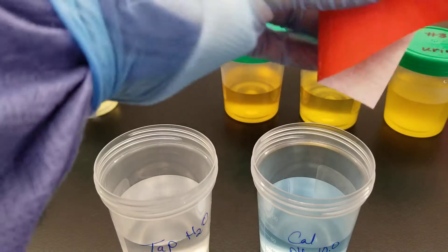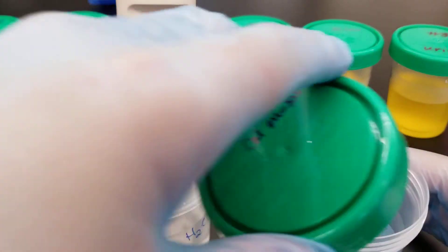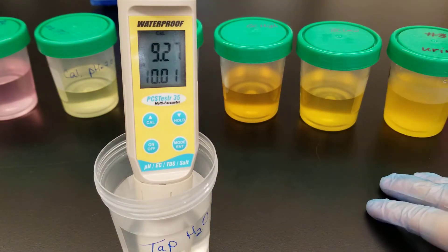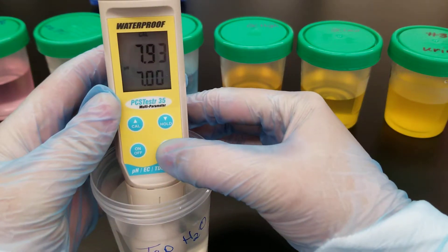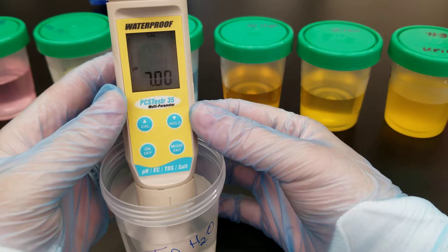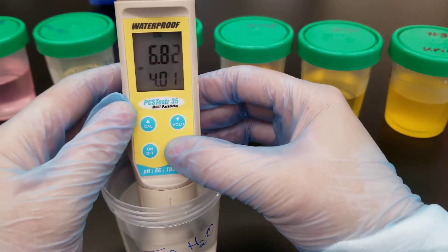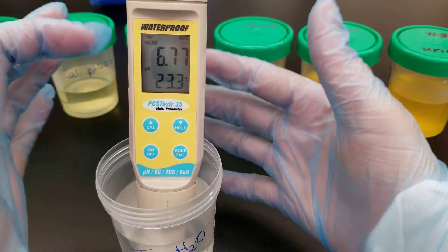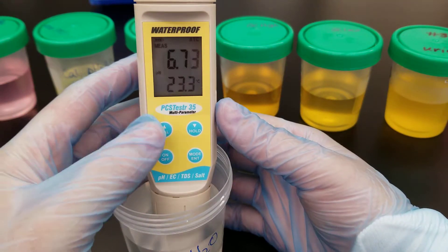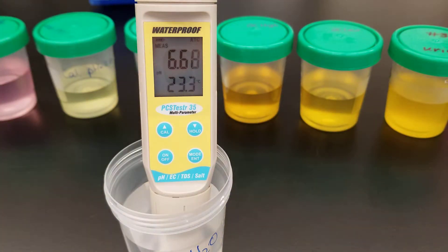Wipe straight down to remove excess fluid and put it back in the tap water. Now we're going to move on to the measurement screen. To get out of calibration mode, we press Cal again, and that takes us out and immediately puts us in measurement mode.